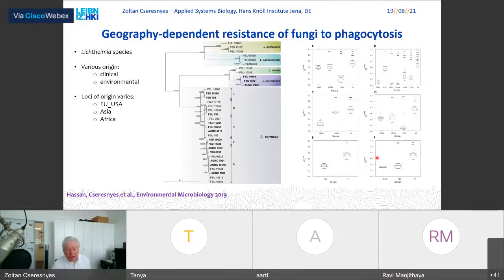And before I go into the technical details of how the analysis, the segmentation itself is done, I wanted to show you just a few slides about why this is useful. And I used our own work just because then I can use any graphs that I want to illustrate the results. For example, we had a study with a collaborator.